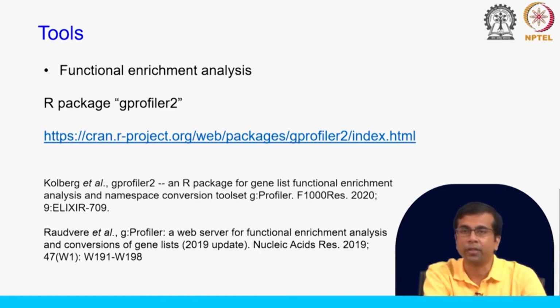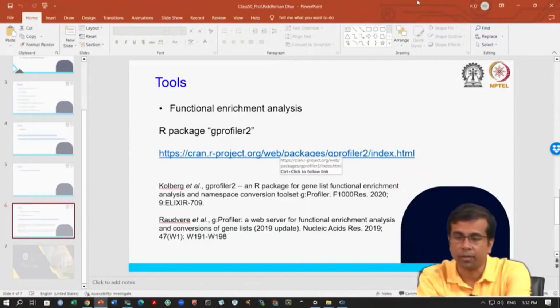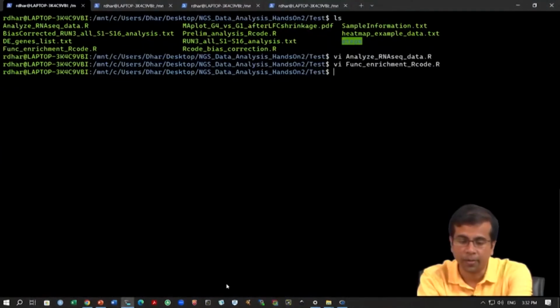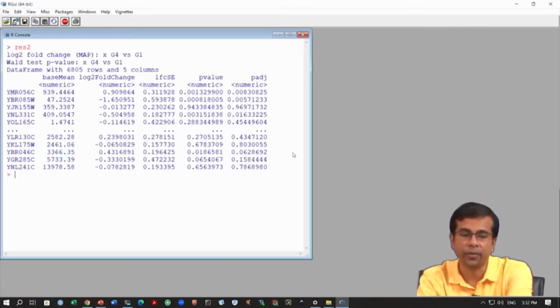Okay. So, the first thing we will do is the volcano plot. We have talked about this in theory, and let us now go to R and we will actually do the volcano plot first, followed by the heat map, and then we will move on to the functional enrichment analysis. Okay. So, for the results part, I can simply show you the results; this is what we got after the last analysis. Remember, we have this RUVg method, then DESeq2 we have run, and this is the final result that we got.